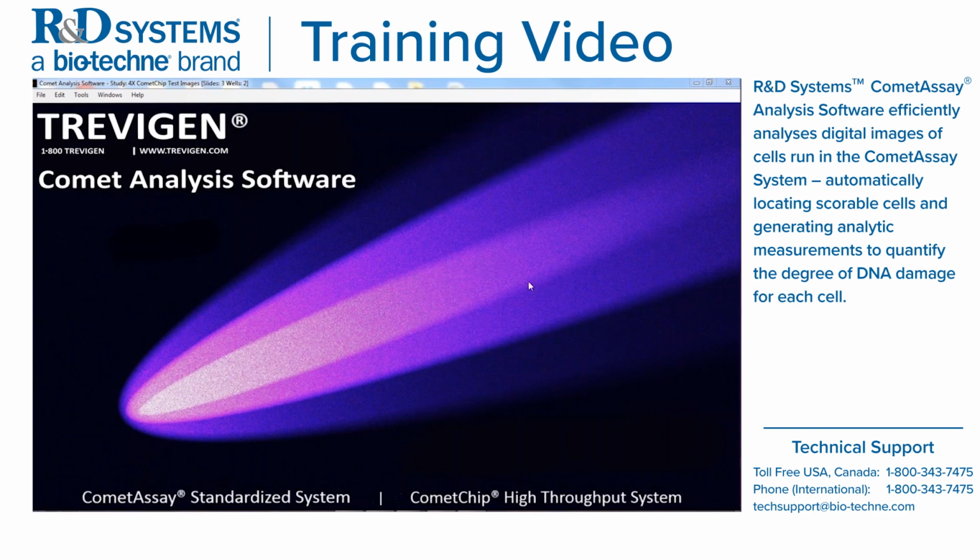So this concludes our demonstration of Comet Analysis Software. Thank you for your attention.